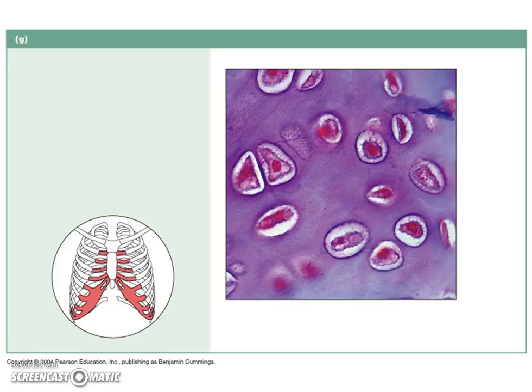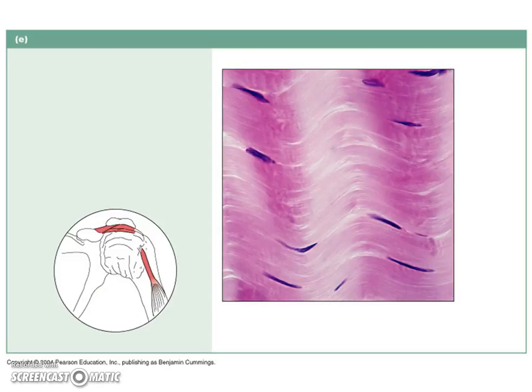Here's another connective tissue. This is cartilage. The little cartilage cells are called chondrocytes, and they're in spaces called lacunae, and they have a plastic matrix in between. To me, it kind of looks like a beehive, or a place where bugs have burrowed in and laid eggs in these little separate sacs. I'm a biologist, so that's probably why my mind goes there, but you can describe it how you want to remember it again. Hyaline cartilage.